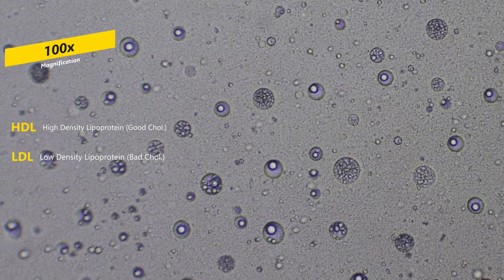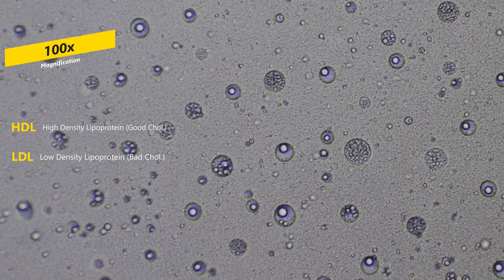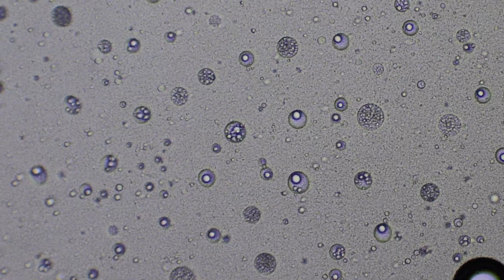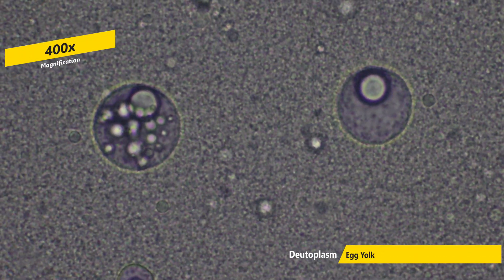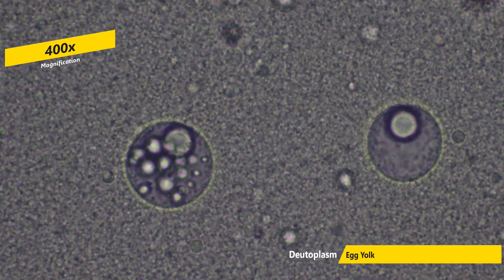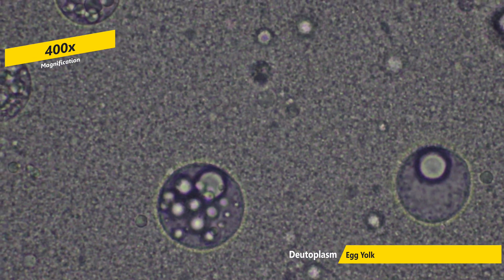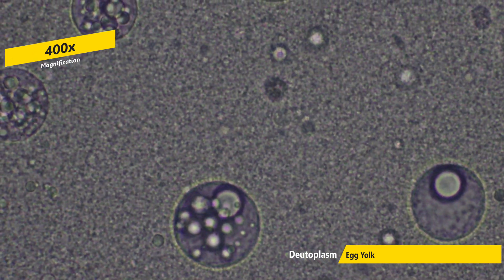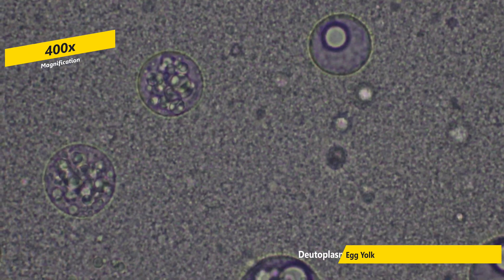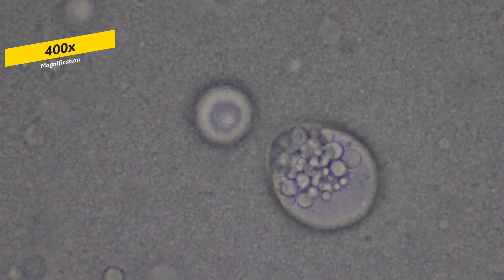Now what you see here are yolk spears. These spears contain various amounts of lipid droplets, or in other words, fat, some of which are contained as subdroplets inside of these yolk spears. These droplets are not always consistent, as they can have well over 50, or as little as one.